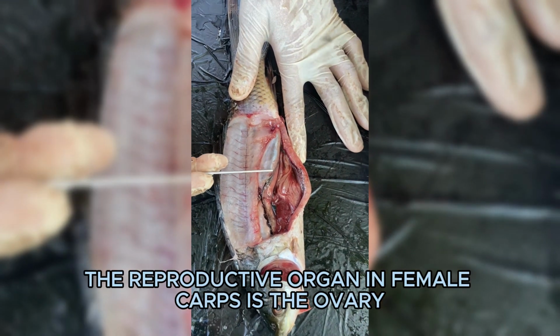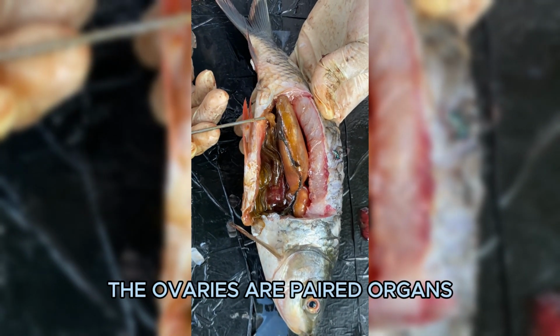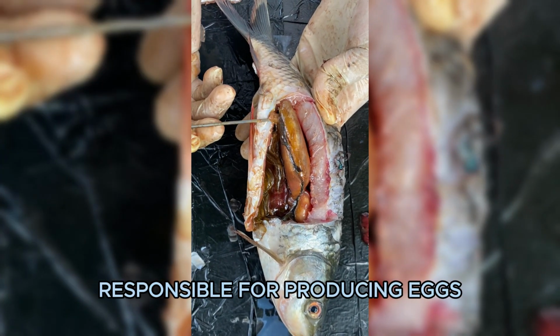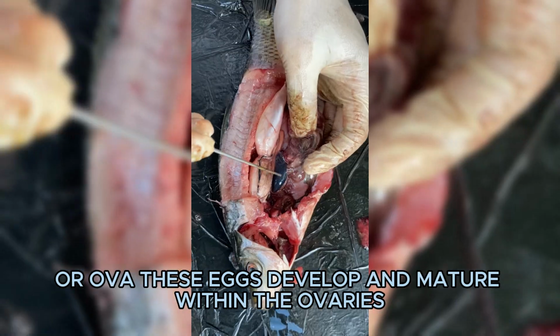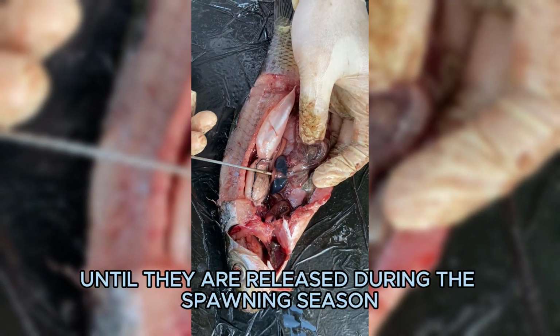The reproductive organ in female carps is the ovary. The ovaries are paired organs responsible for producing eggs or ova. These eggs develop and mature within the ovaries until they are released during the spawning season.